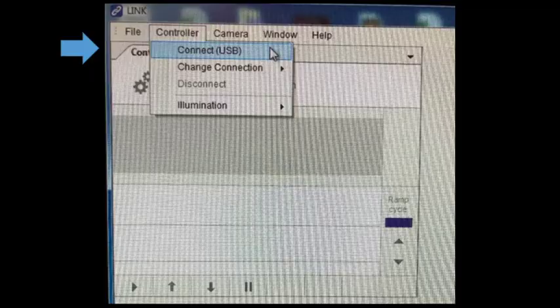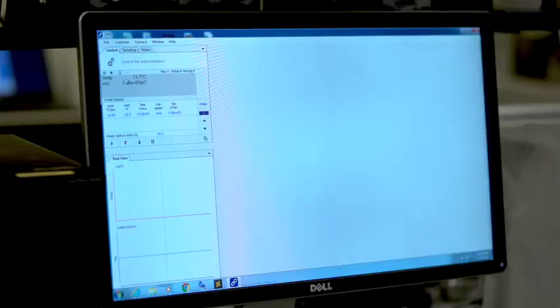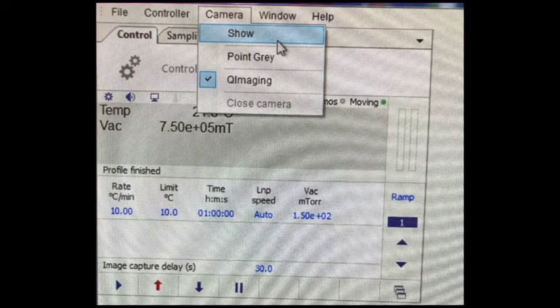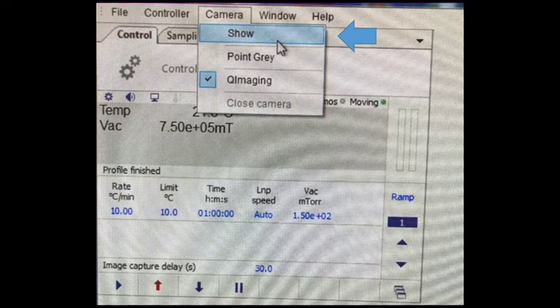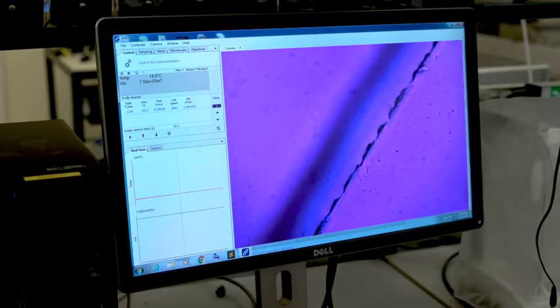The temperature and vacuum level should appear in the top left window. Navigate to the camera tab in the toolbar and click show. The microscope image should appear on the screen.